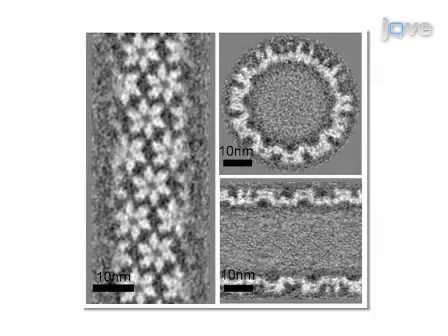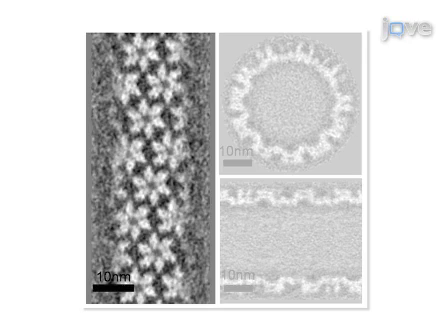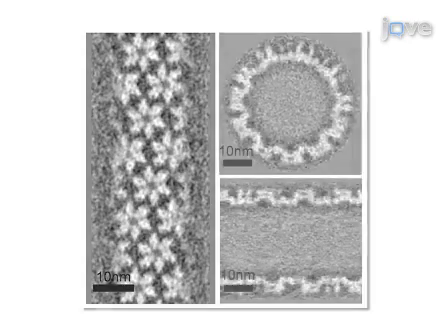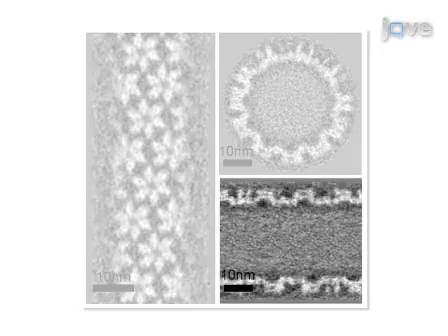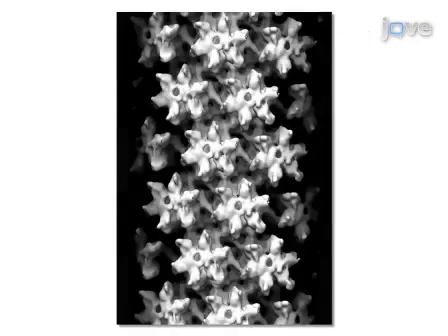The density map of capsid assembly tubes is displayed as 3 orthogonal slices: parallel to the tube axis and close to the surface, perpendicular to the tube axis, and parallel to and through the tube axis. The displayed structure results from surface rendering of the 3D density map contoured at 1.8 sigma enclosing 100% volume.